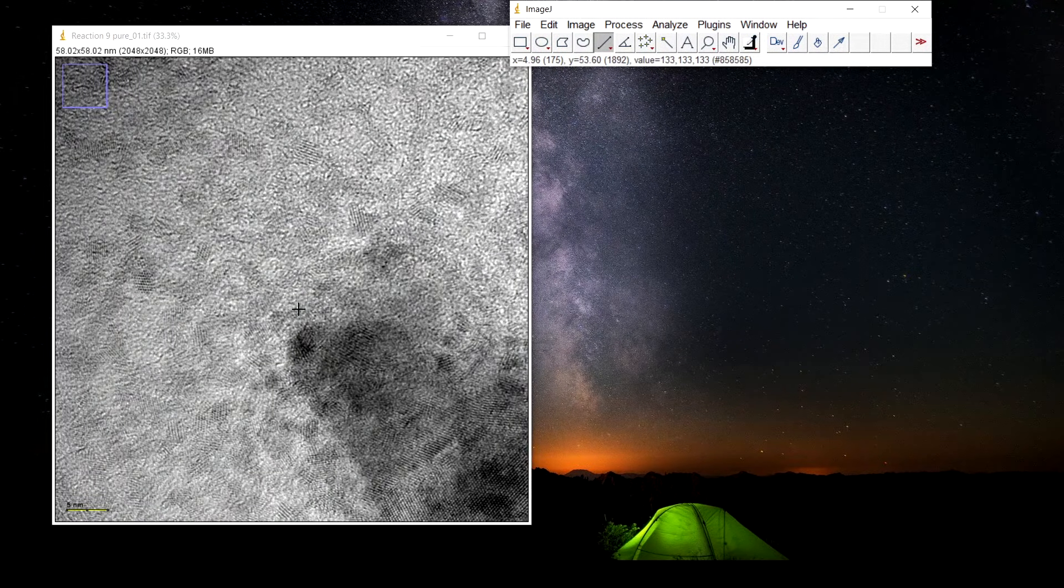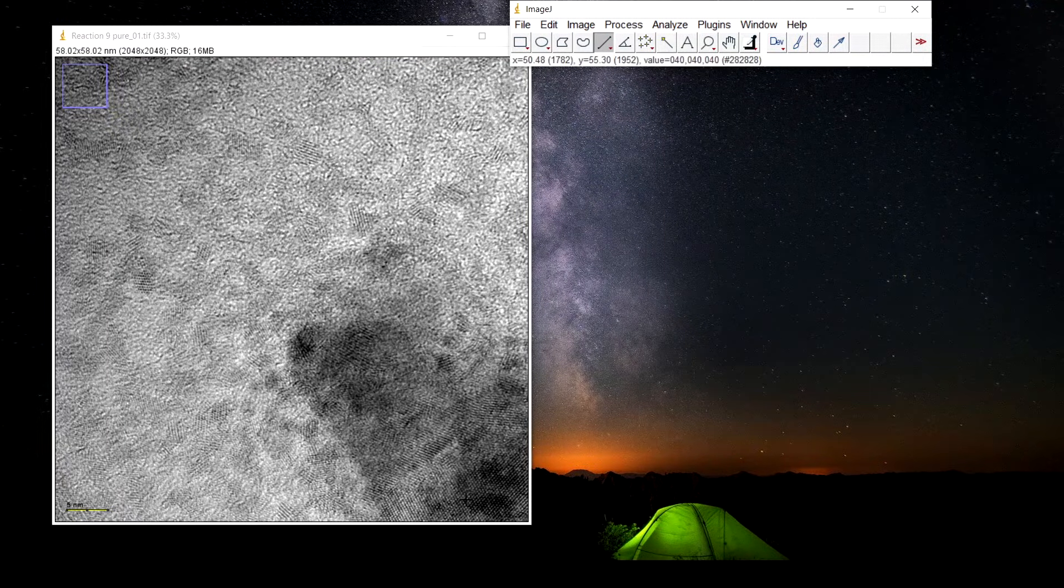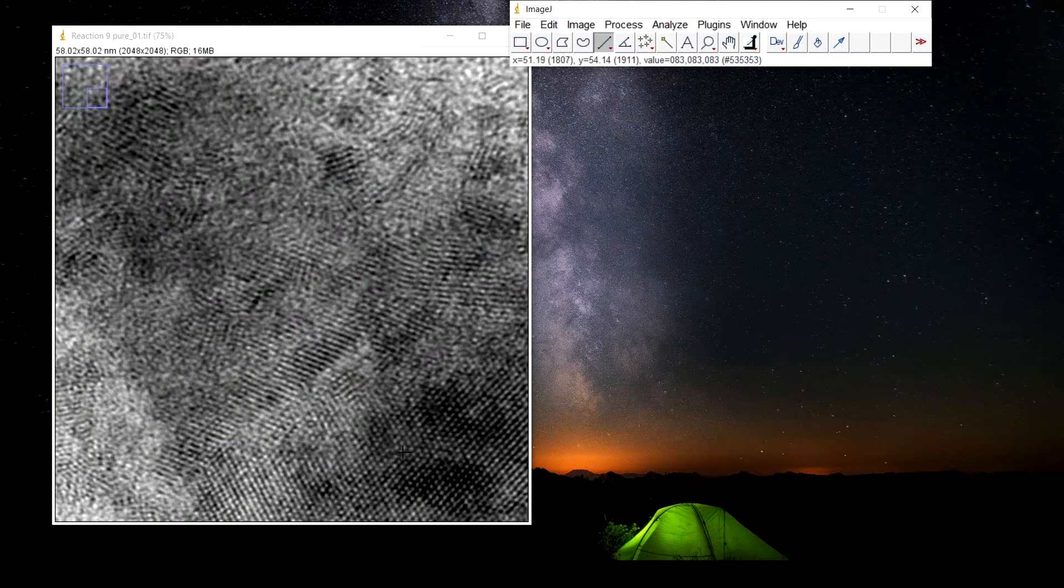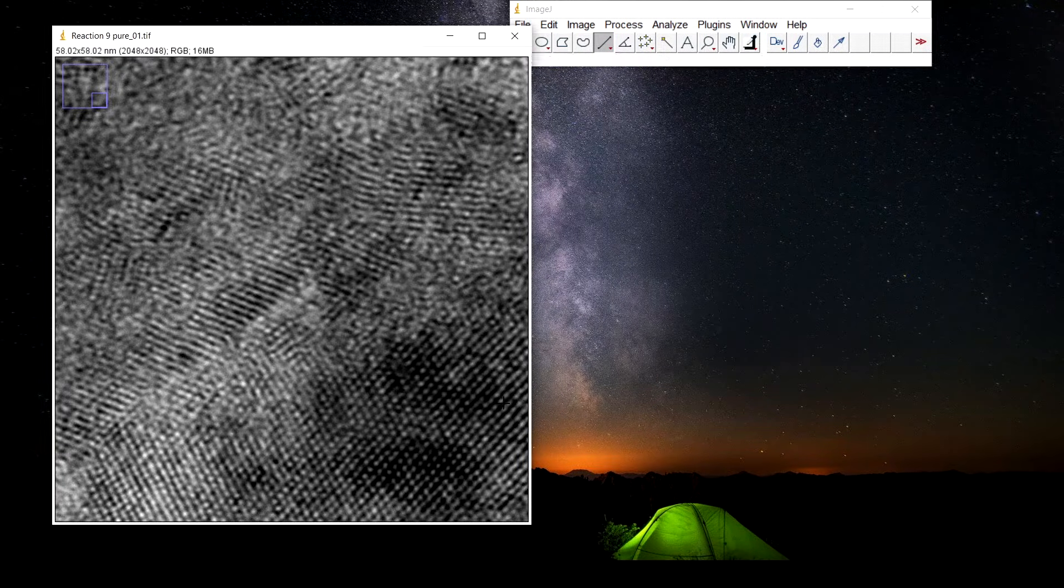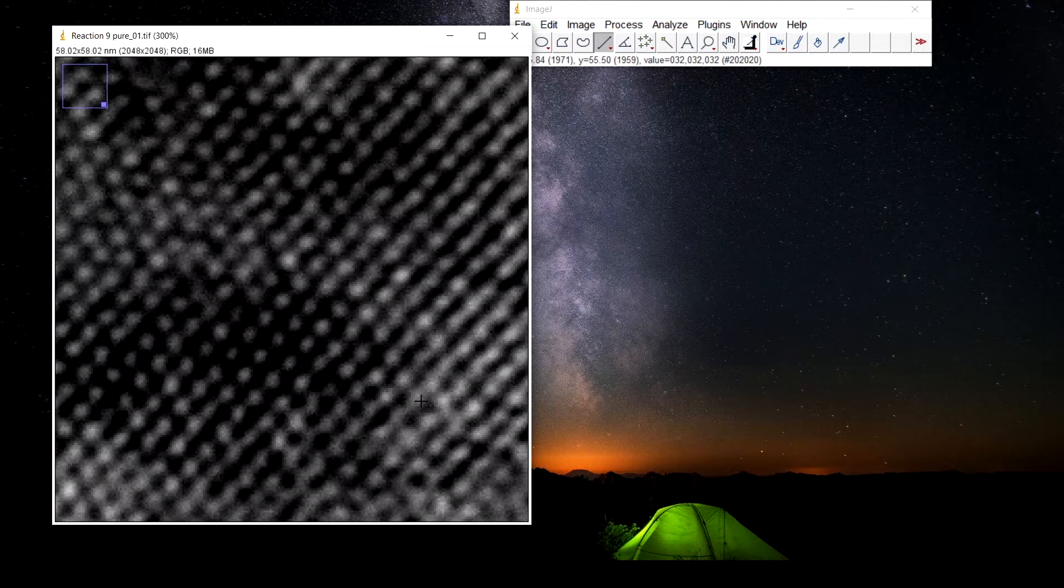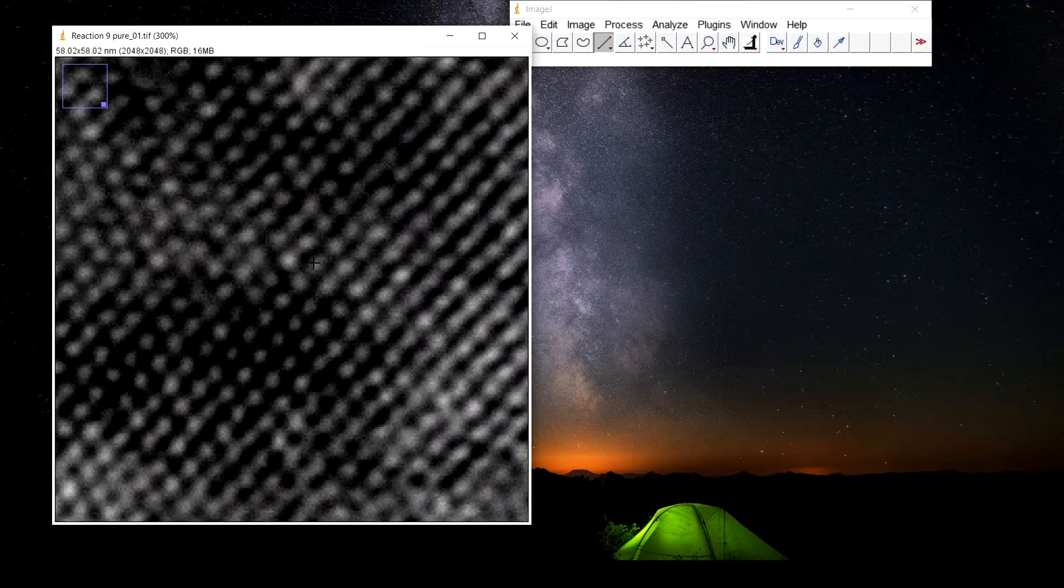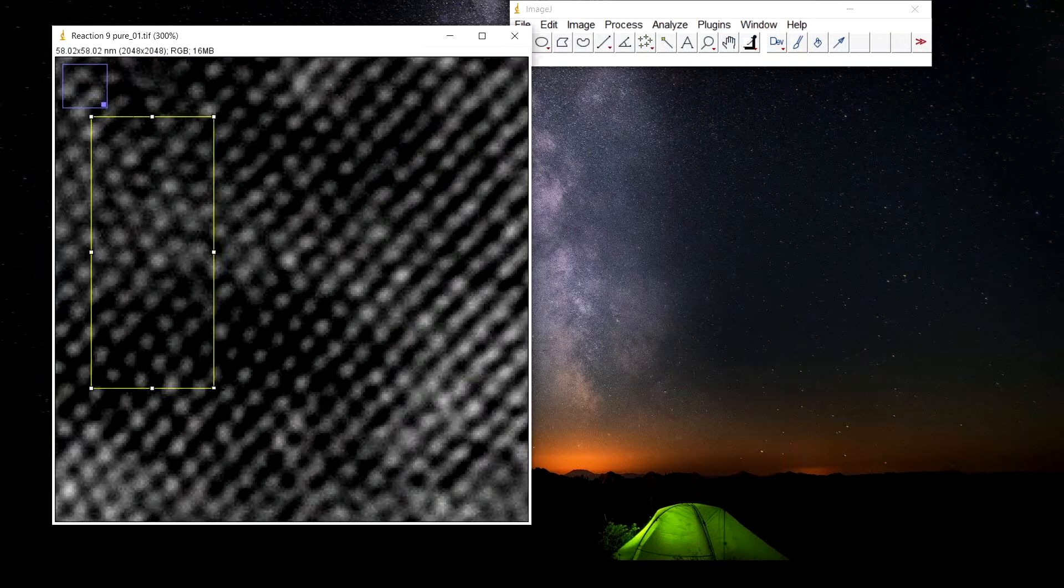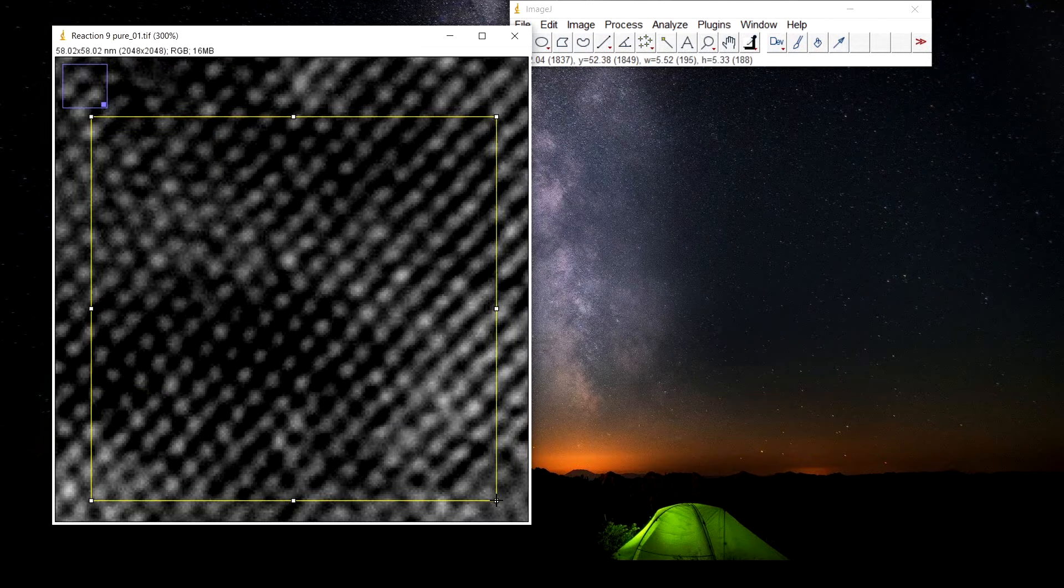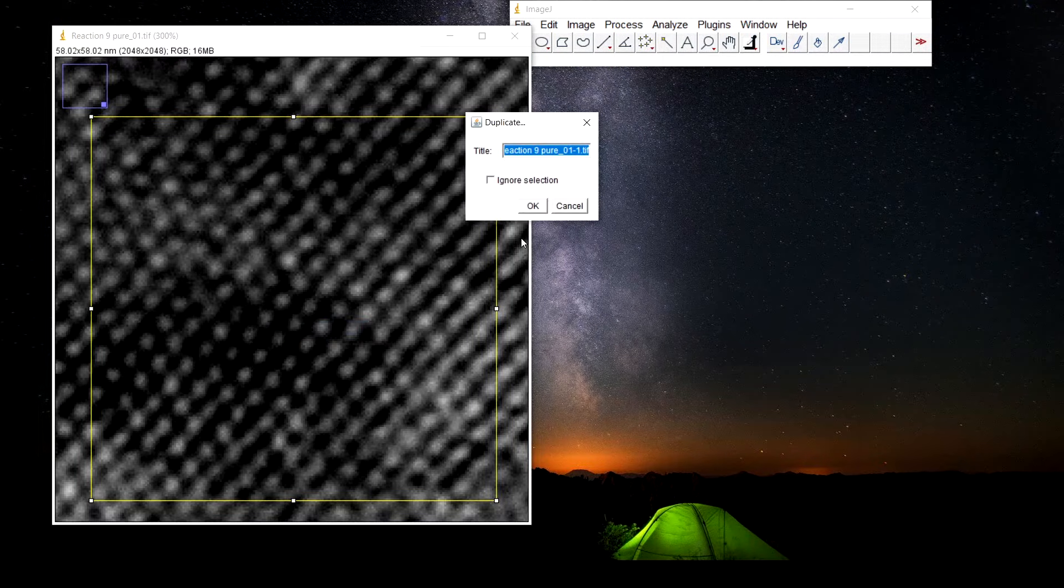Here we have to select the interplanar spacing and in this image we will select the area where it is much clearer. We will zoom into the image then select the rectangle tool, select the image duplicate.